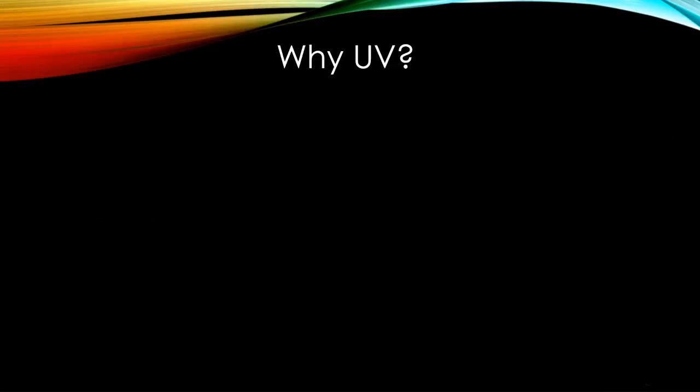So why UV? I'm not going to lie, there are other techniques that could be used in a similar testing sense. For example, another paper, Barzadina et al., used HPLC and the exact same methodology, HCA, PCA, etc., to perform a very similar study.